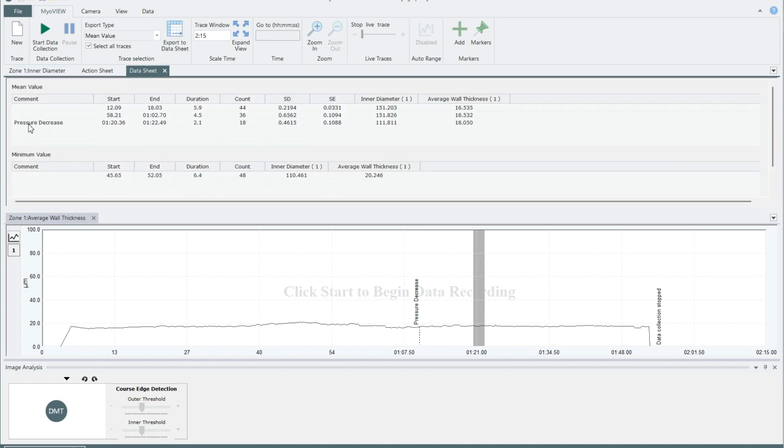We'll highlight another couple of selections to take additional readings and add them to the datasheet. If you utilize the comment feature during your experiment, the closest comment before your selection will be added to the measurement. Now, when we view the datasheet, we will see the last three selections that we made, including the minimum value selection below, and the last selection that also includes the comment. You can take these measurements during data acquisition or after, it makes no difference.